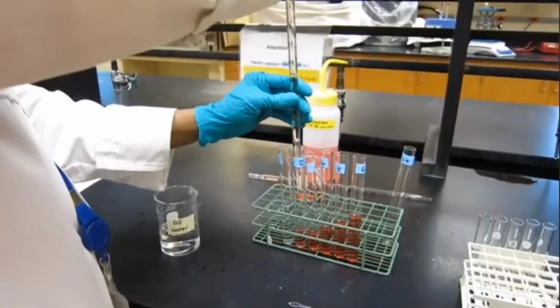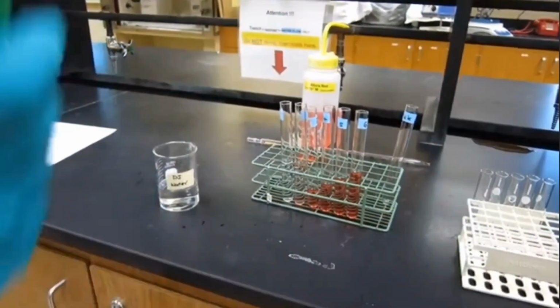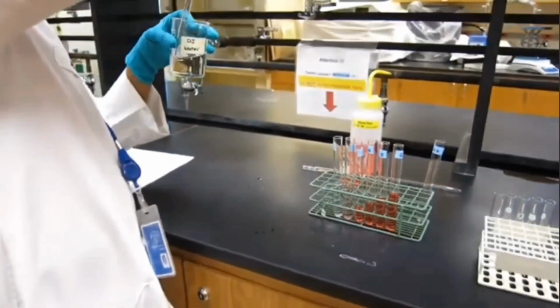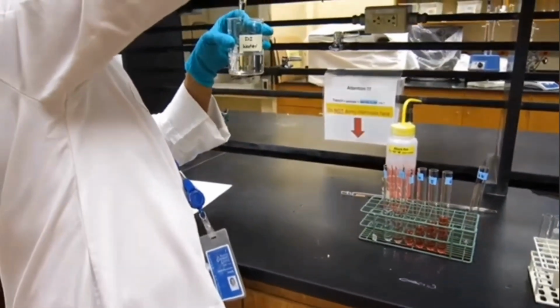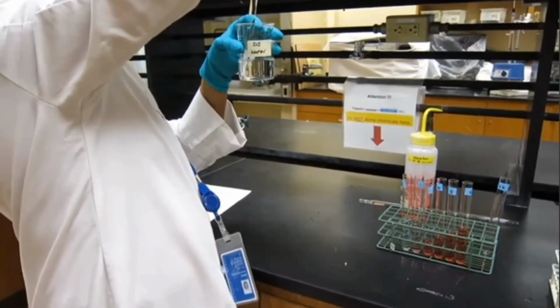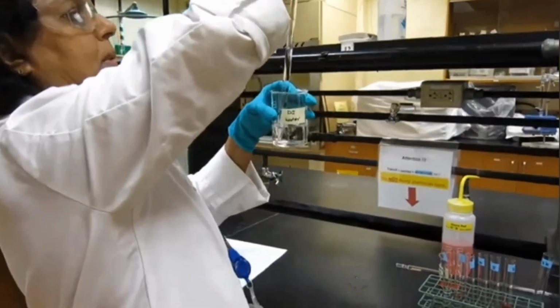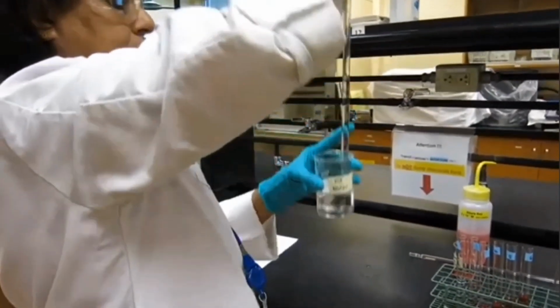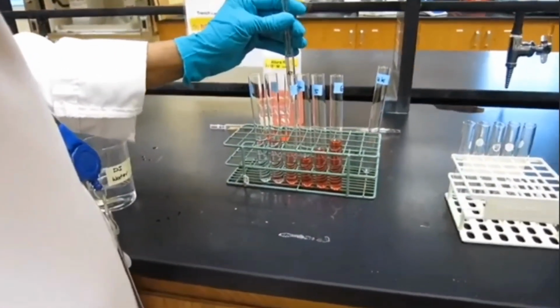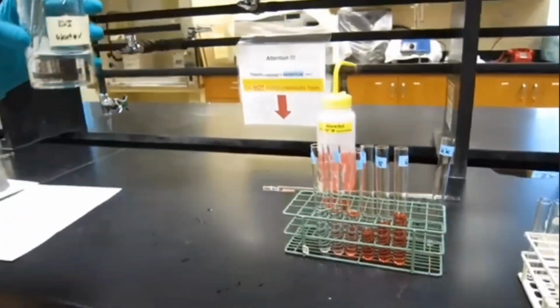The third one would be 6 milliliters. Fourth one would be 4 milliliters of water. Fifth one would be 2 milliliters of water. And then the sixth one, we added 10 milliliters of Allura red stock solution, and we don't need to add any water to that one. So at the end, we will see all the test tubes will have 10 milliliters of our solutions, and that's going to be our solutions for the calibration curve.